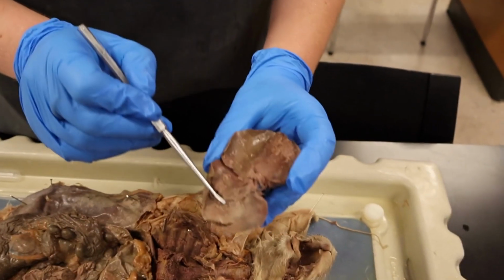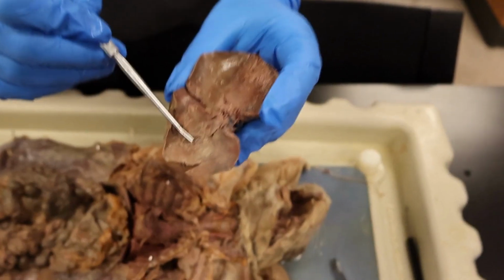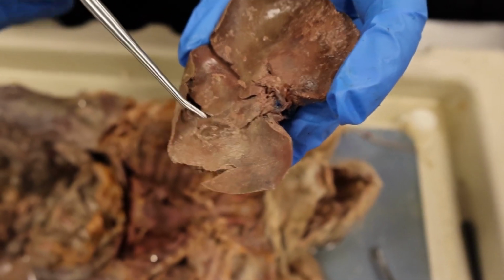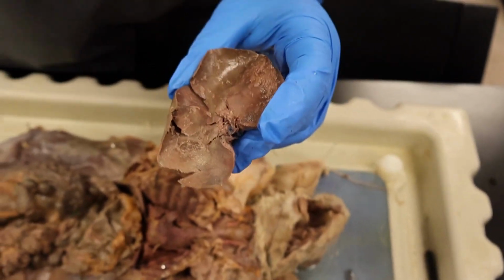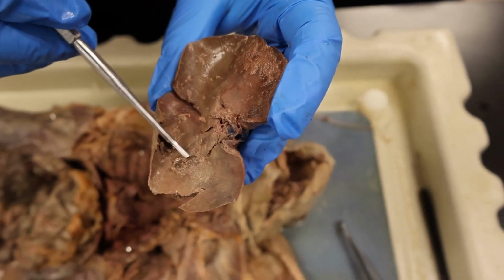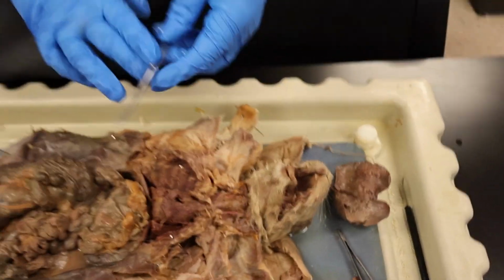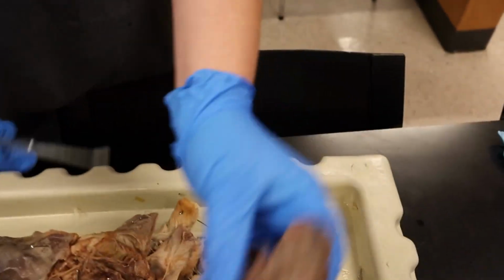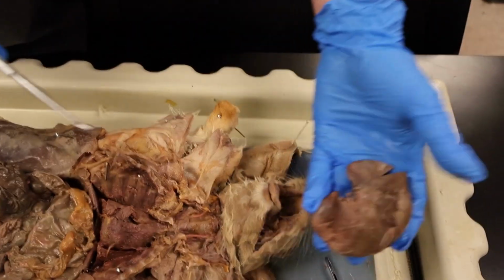Alrighty, so this darker, squishier part is going to be the gallbladder. This one is going to help to digest, it's going to make some bile and help break down that food. It's on the back side of the liver, on the very bottom, still being part of the digestive system.